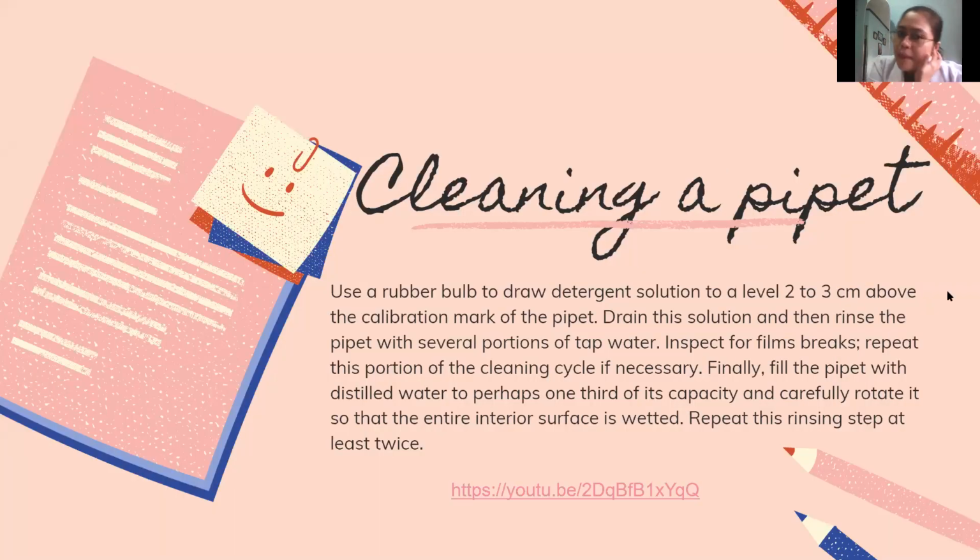So when we clean the pipette, I will not dwell sa ani discussion kasi na-discuss ko ni siya when we had our pre-lab discussion. I have also given you the link for the video kung paano i-clean ato ang pipette.